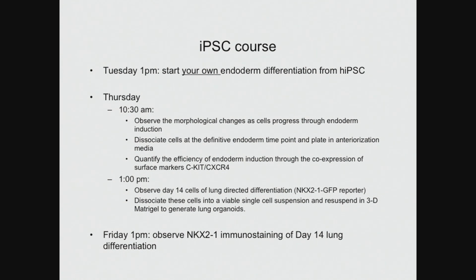On Tuesday you met Dylan Thomas and you started the first step of an endoderm differentiation using human iPS cells. Those cells would have been in definitive endoderm media for just about 24 hours this morning, not quite. He has pre-prepared some cells that he started a differentiation on Sunday, so they should be primed today. You'll get to have a look at those cells in the next session and observe the morphology.